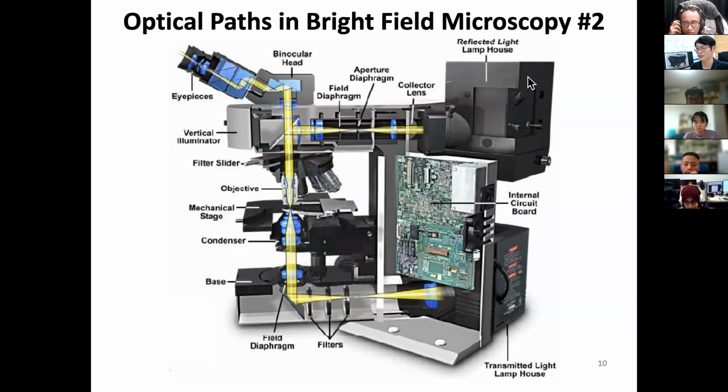Epifluorescence microscope. What that means is you have a fluorescent lamp and a dichroic mirror, which we'll talk about later, and then it'll shine on the sample from the top. That's what we call epi illumination, and then the fluorescence light comes back. Here, I want you to draw your attention.